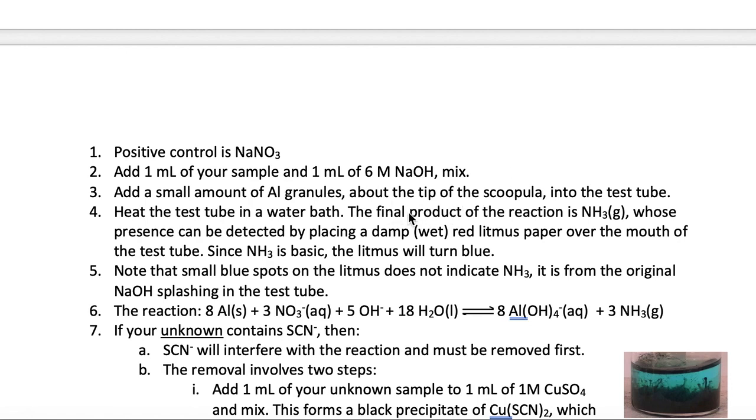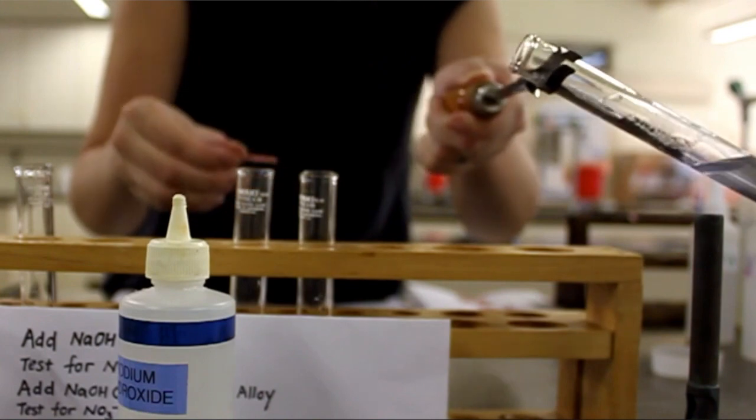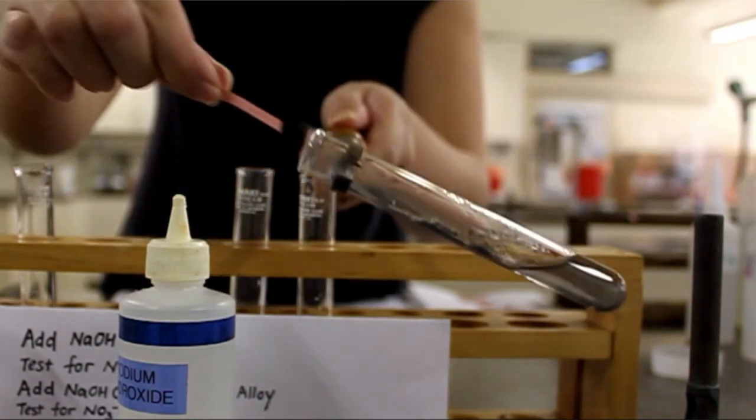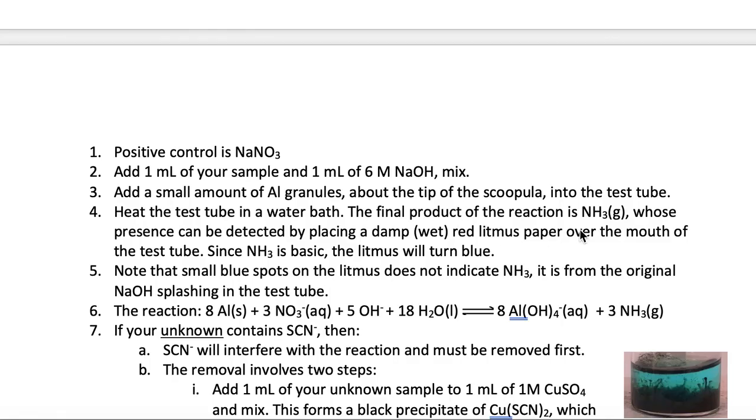While this mixture is heating in the water bath, you're going to get a red litmus paper and wet that litmus paper with water. When the mixture in the test tube is hot, you put the litmus paper over the mouth of the test tube. If nitrate is originally present in the sample, ammonia would be produced as a result of the reaction shown here.